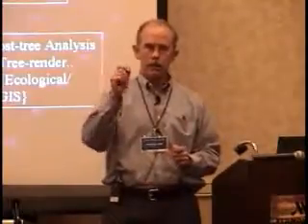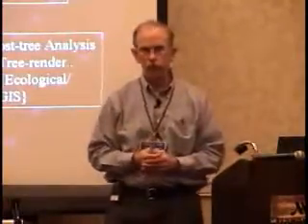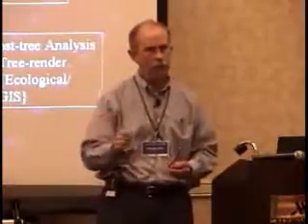They will look at images of sunflowers. They will hold them in their hands. They will snap pictures. They will make drawings. If they have a 3D object, they'll scan it, scan a seed, and look on the inside of it. And for each of those 400 taxa, they will collect characters, morphological features. This is something that has happened forever, okay? Darwin noted features of organisms and how they vary between taxa. So he recorded characters and he recorded states of those characters for individual taxa.